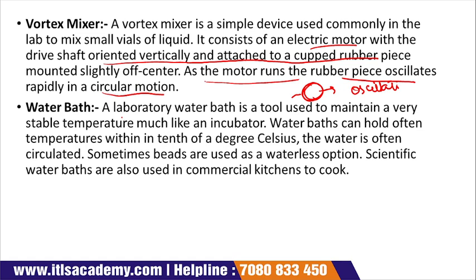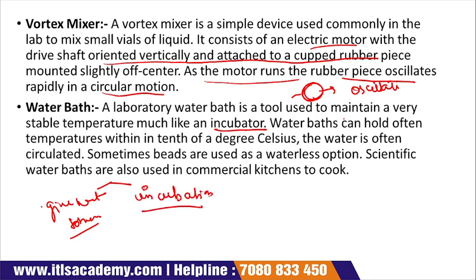The next is your water bath. A water bath is simply used to maintain a very stable temperature, just like your incubator. Again, there are two ways to use a water bath. First, suppose you have to give heat to something, then we use the water bath, and sometimes we use it for incubation. A water bath can hold temperature within a tenth of a degree Celsius.